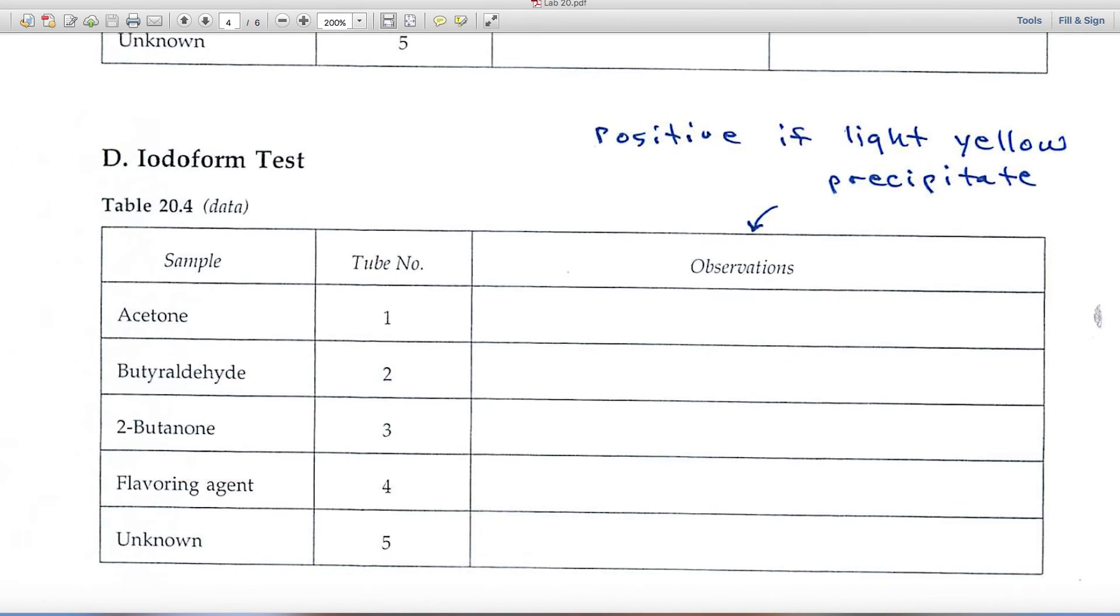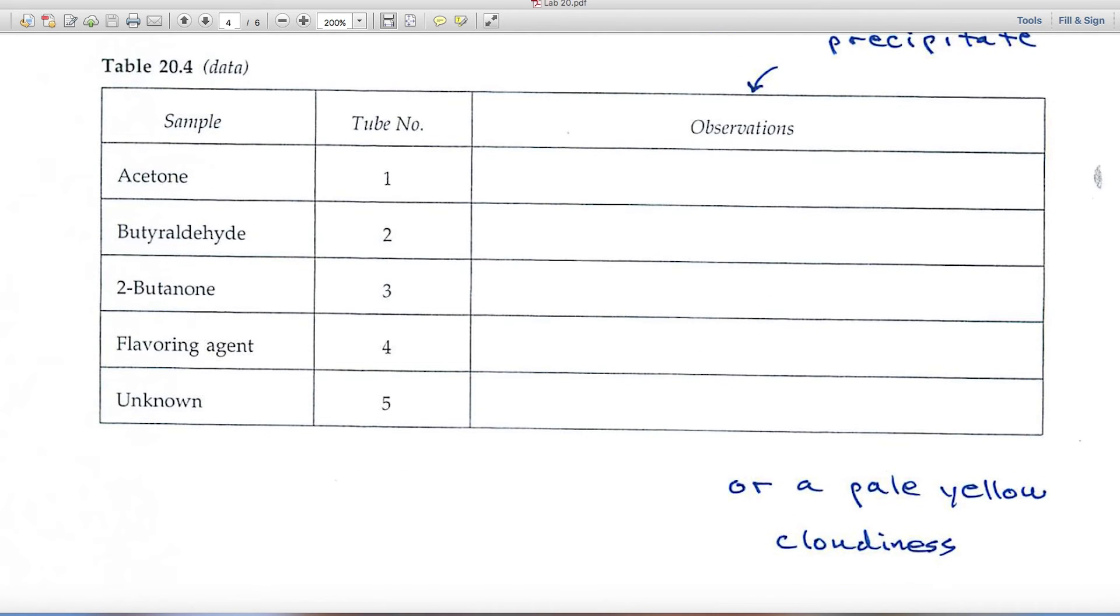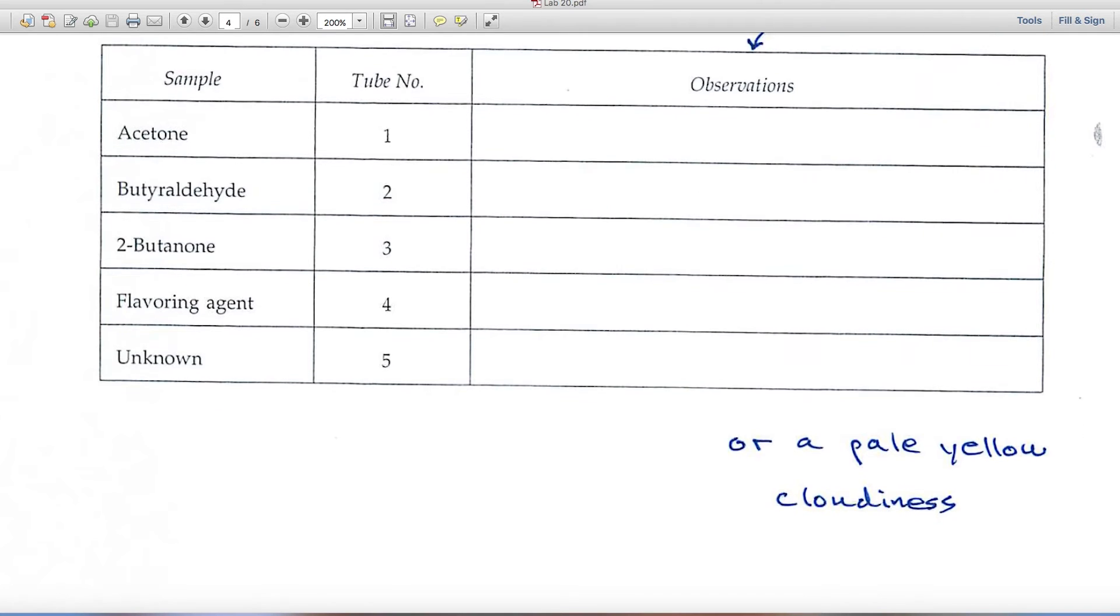Part D, the iodoform test. This is positive if you get a light yellow precipitate. And sometimes, rather than a full-fledged precipitate, you'll only see a pale yellow cloudiness. So note that as well.